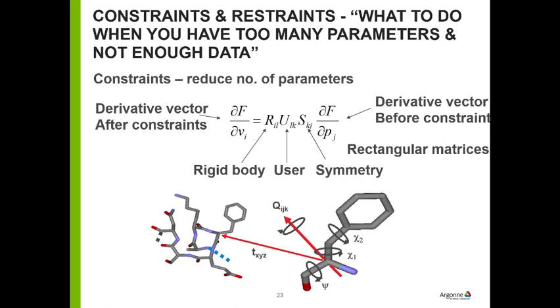That's an example of a constraint. Another one is if you have an atom on a special position, some of the coordinates you cannot refine because it's limited by where it is in the crystal structure, or you can have two of the components be the same, like it could be X, X, Z, or something like that. So those things are constraints.